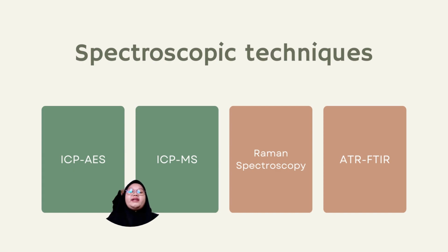Among spectroscopic techniques, ICP-AES and ICP-MS are not used for routine analysis as they are very costly, require maintenance, and also involve sample preparation. In fact, these techniques are often used only when other instrumental techniques, which are simpler, faster, and less expensive, cannot provide a definitive answer.